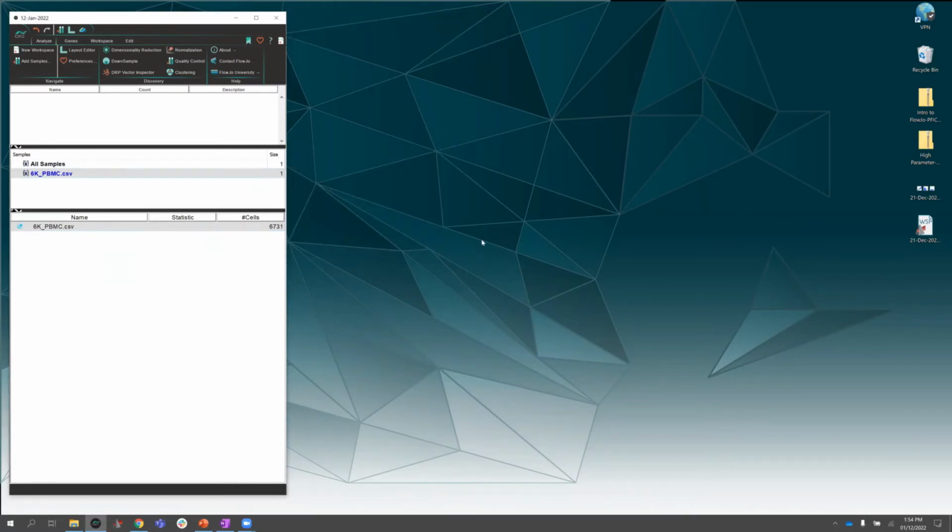And it's done. So how do I know it actually worked? This little symbol next to your sample, right? The symbol matches the same symbol that's in the normalization button. It's going to turn a blue color, right? So earlier it was gray. And once I did the normalization, it turned this blue color, right? So that's how I know the normalization actually applied. Okay. Right, so now we've normalized.